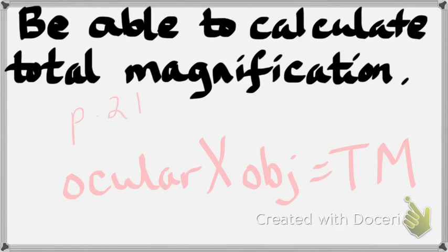How do you know which numbers on a microscope are magnifications? Because there's all kinds of numbers on a microscope. How do you know which ones are the magnifications? They have X's. So there'll be a number with an X. So you don't have to memorize them. You just have to find them on the scope and know to multiply. But okay, on total magnification.